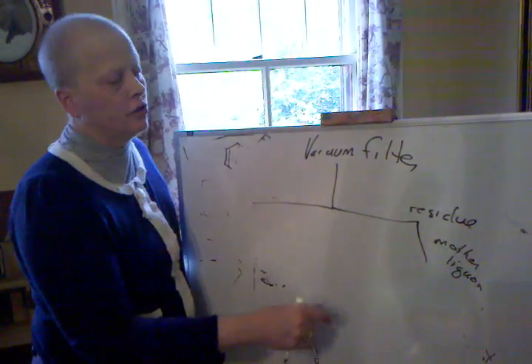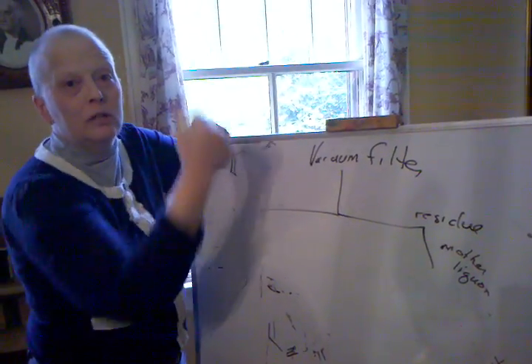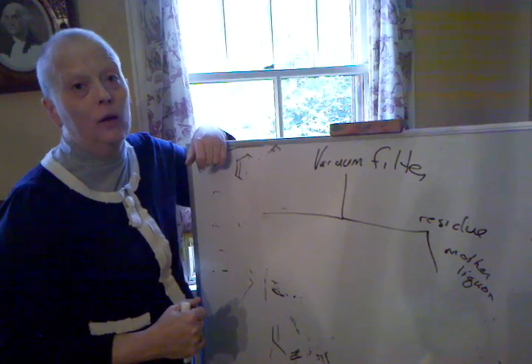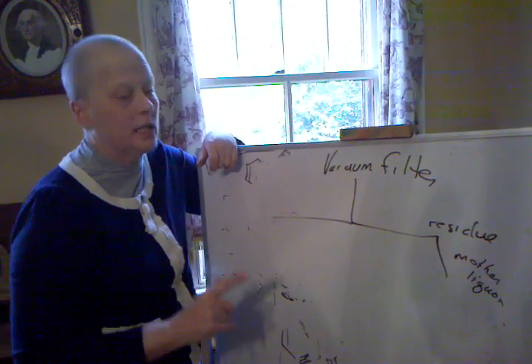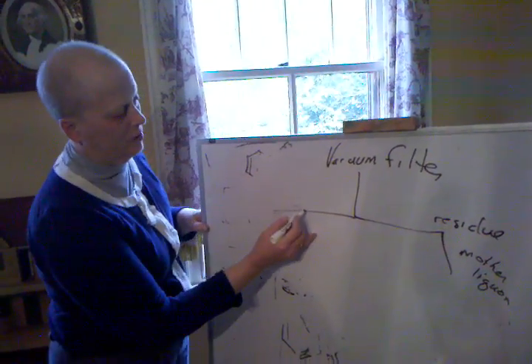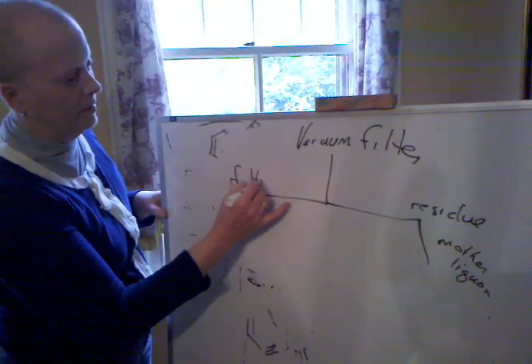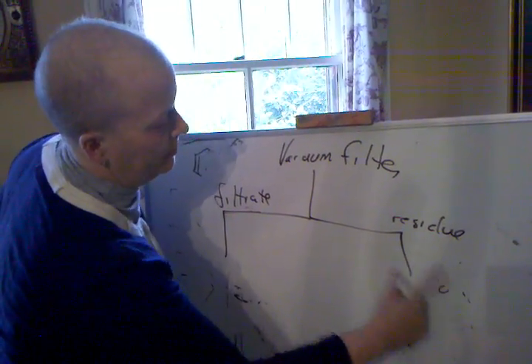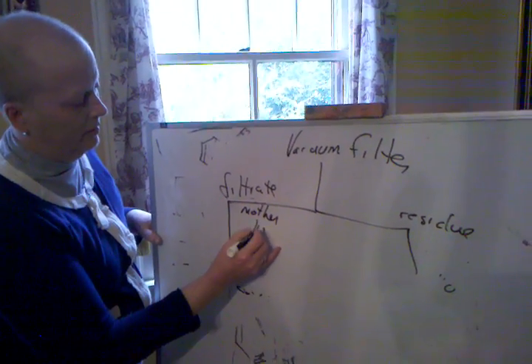They're staying in solution. And if you start concentrating that down to get more of those desired molecules out, it's more likely you're going to have contaminant come out as well. I hope that makes sense, because solubility is related to concentration as well as temperature and the nature of the molecules. Okay? So then the filtrate, I'm talking about the mother liquor over here. The filtrate is the mother liquor. And like I said, you could get more out of this if you want.